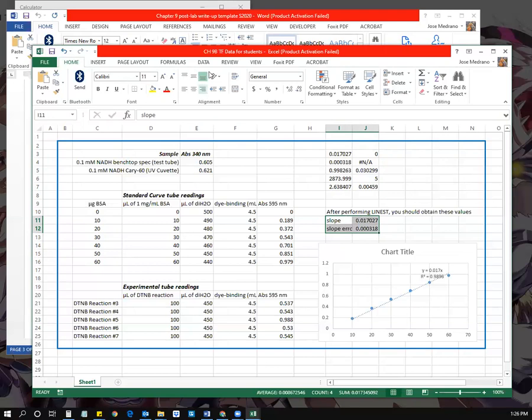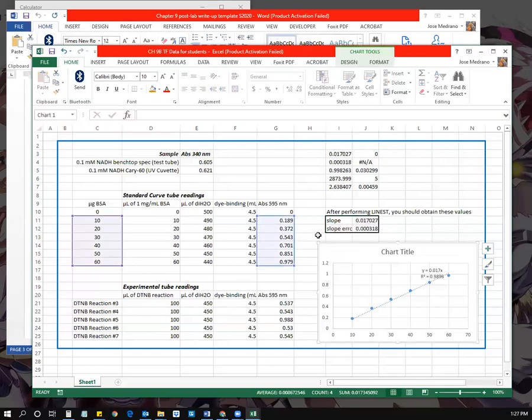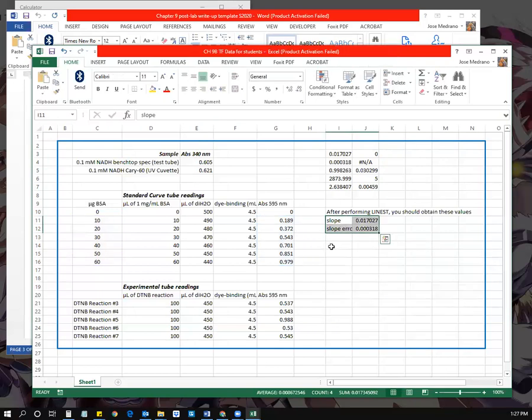These are the two values that we're going to need to start working on concentration. So I'm just going to remove this standard curve here and this extra part, and then start working on the TF data. To figure this out, we need to back calculate going from absorbance to micrograms. And so I'm going to put another, this is actually going to be a little difficult to do. I'm trying to figure out how to do this effectively.